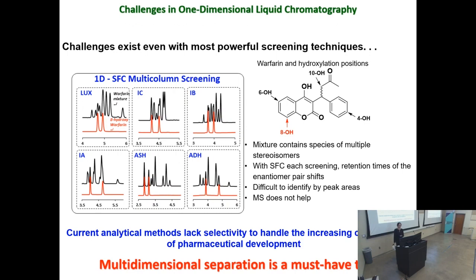And also, in this case, the MS doesn't help because the hydroxy warfarin has the same molecular weight and also shares a similar mass spec fragmentation pattern. So in this case, let us think about multi-dimension separations.